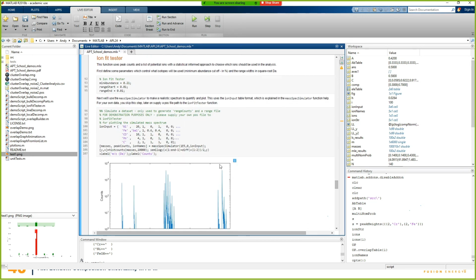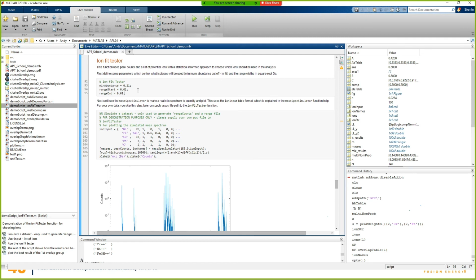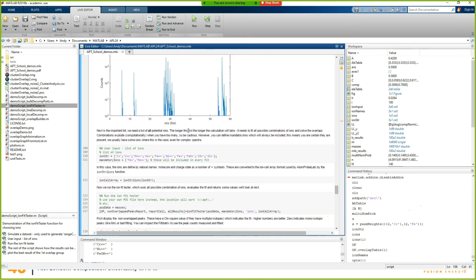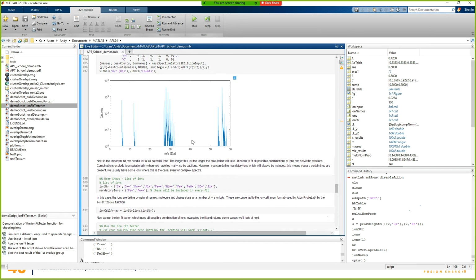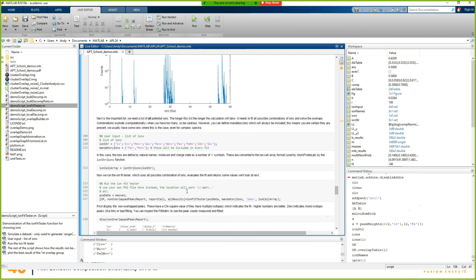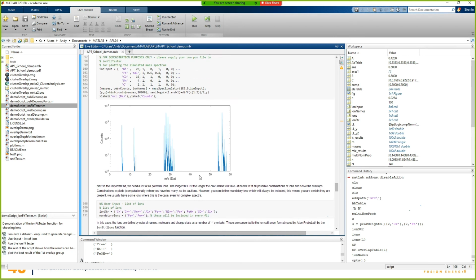So this is taken almost entirely from the demo script. AtomProbe Lab has a bunch of demo scripts that you can use. There are some parameters here that you probably don't need to worry about. I'm loading here. You would load a data set. Here I'm simulating a data set using the ion input mass spec simulator as shown before. This is what my mass spectrum looks like. It jumps out as being synthetic, but it's got a bunch of different peaks. Some of them are overlapped, some of them aren't overlapped. We've got our old friends, iron and aluminium and things in there.